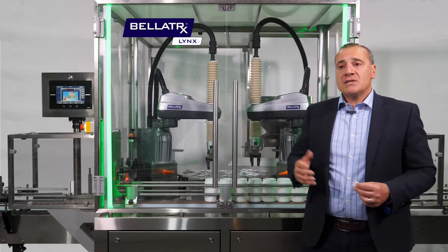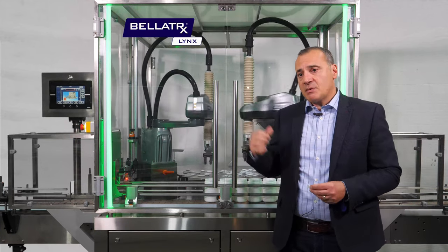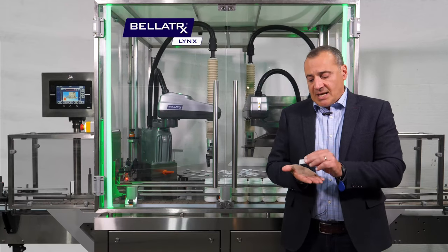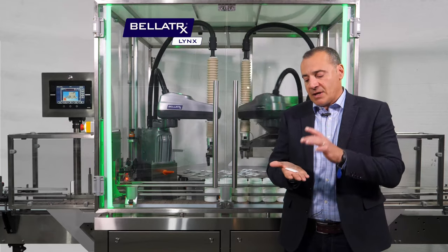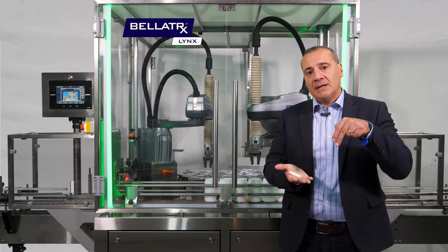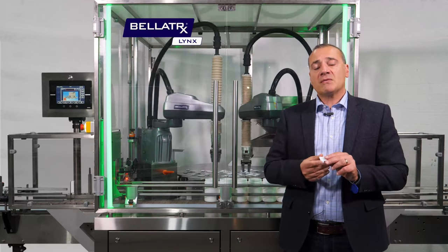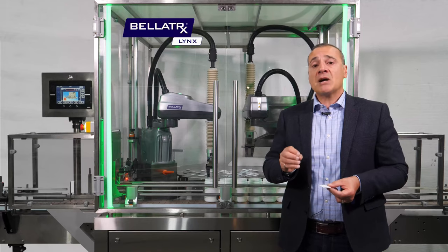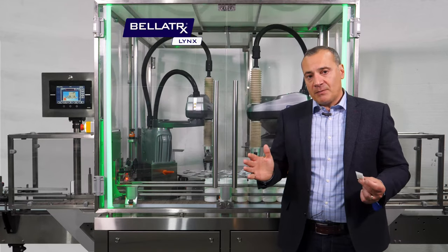To look at the flexibility of different formats, for different size desiccants we would use suction cup end-of-arm tooling. That allows us to pick desiccants as they sit flat onto the table. The camera takes a picture and looks at the rectangle of the shape of the desiccant, and the suction cup comes in and picks it. It's a fairly simple application because we can pick the desiccant regardless of orientation and regardless of whether it's on top of a second or third desiccant or a pile — as long as we identify the top layer, we can pick very clearly.